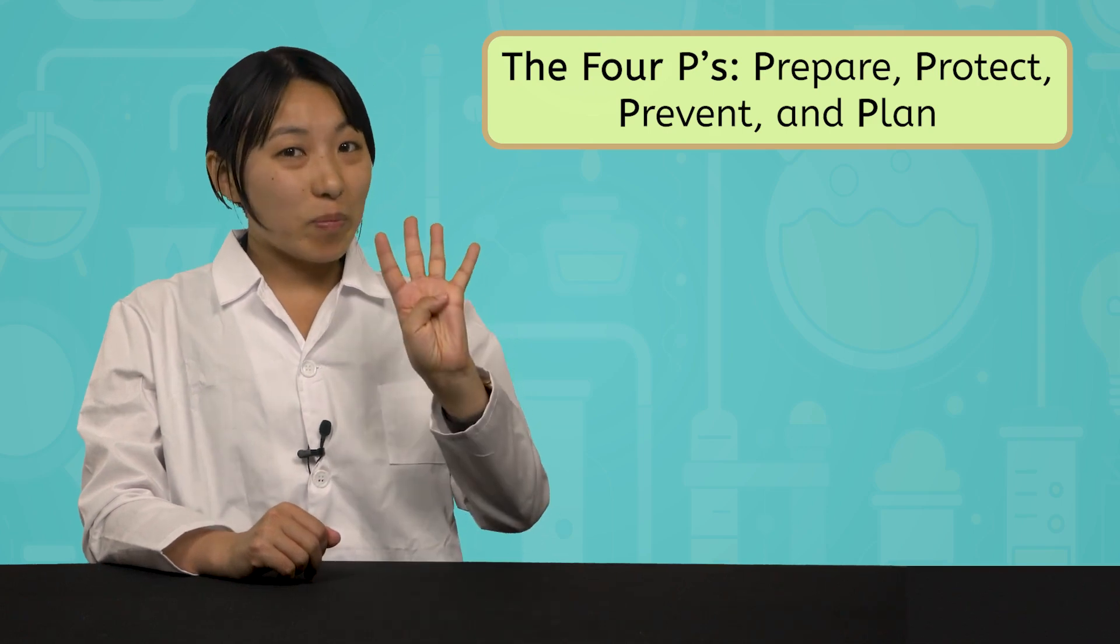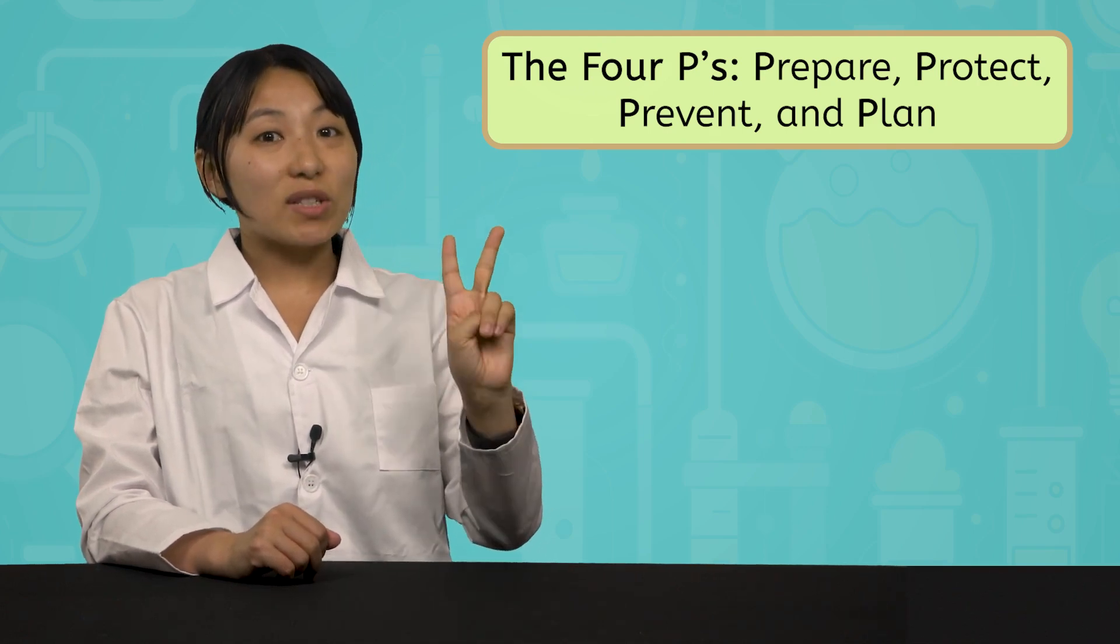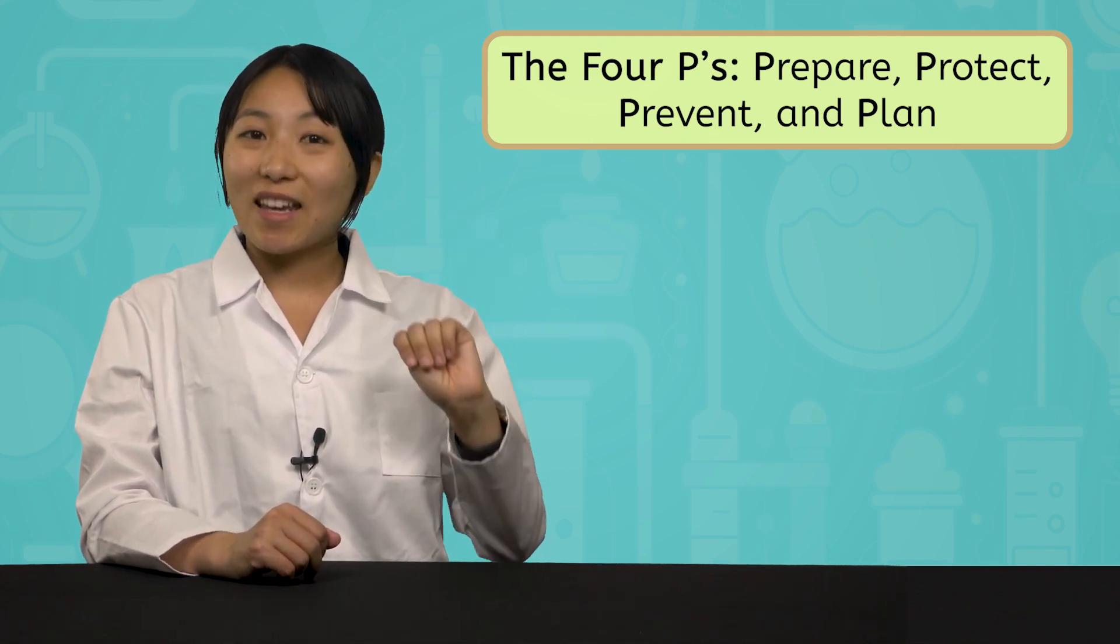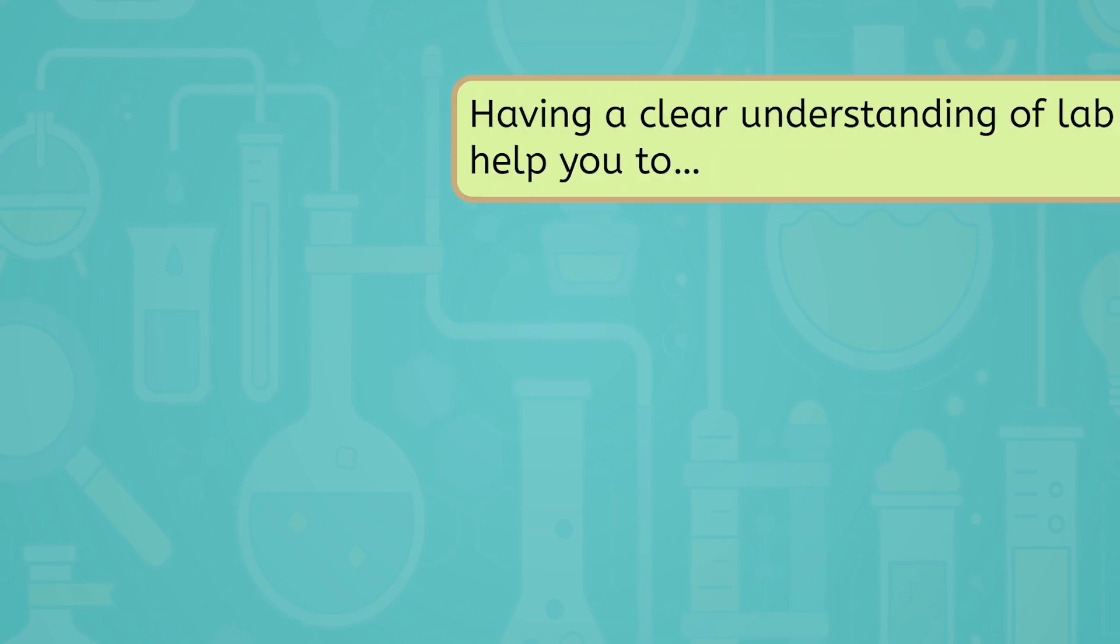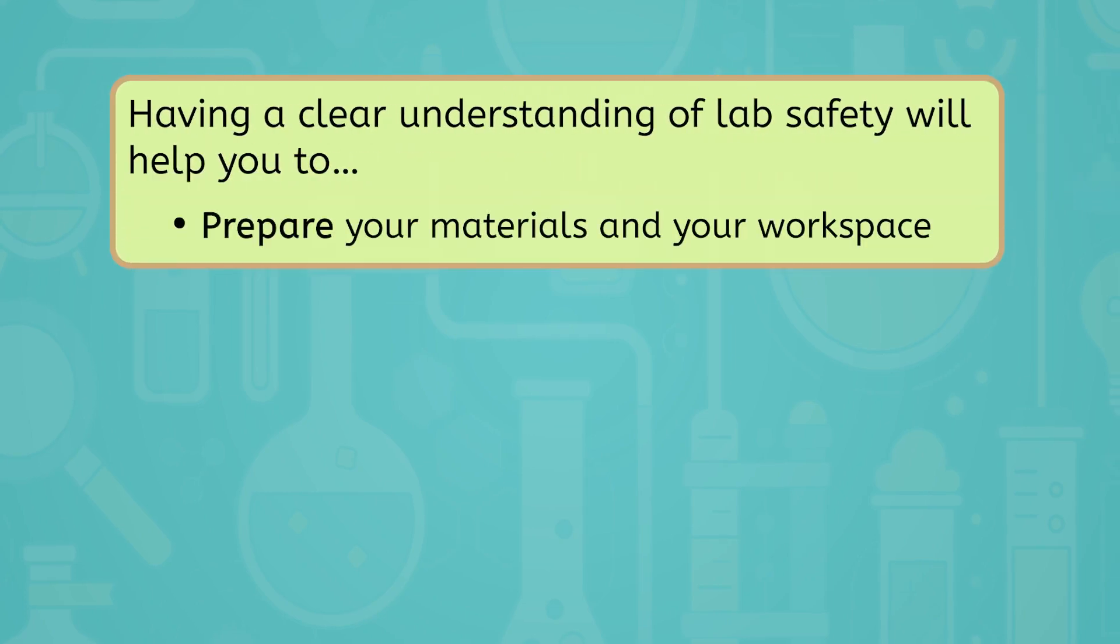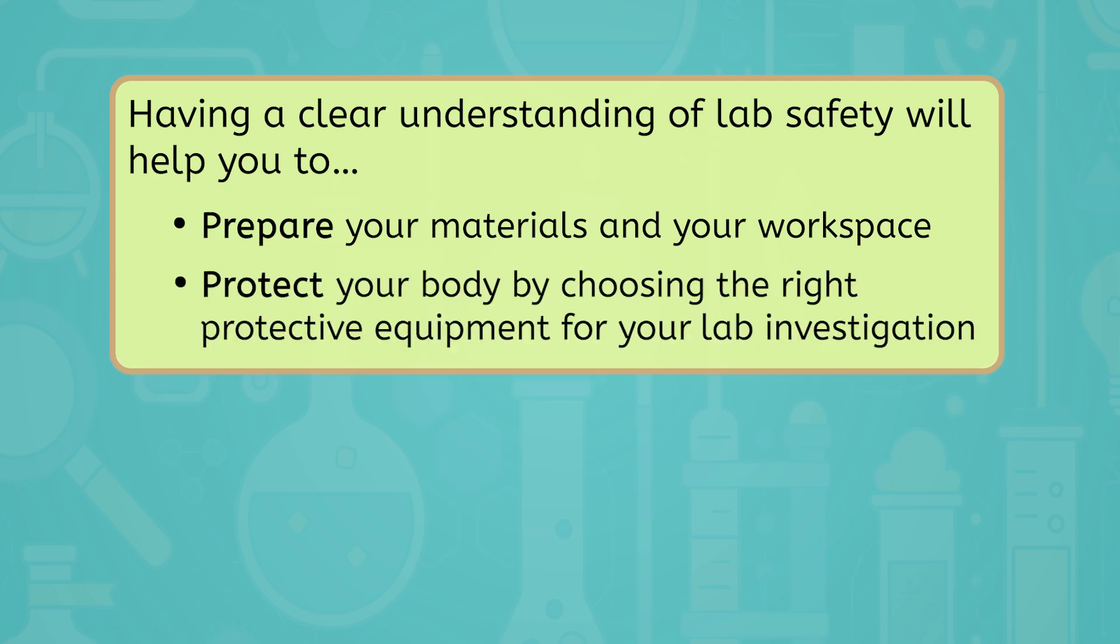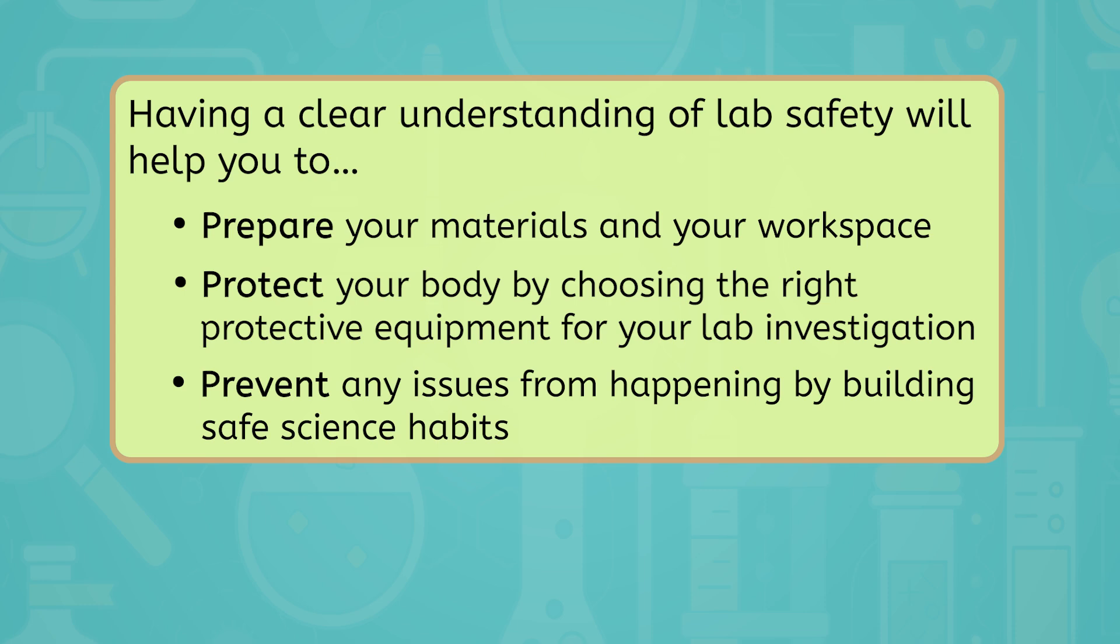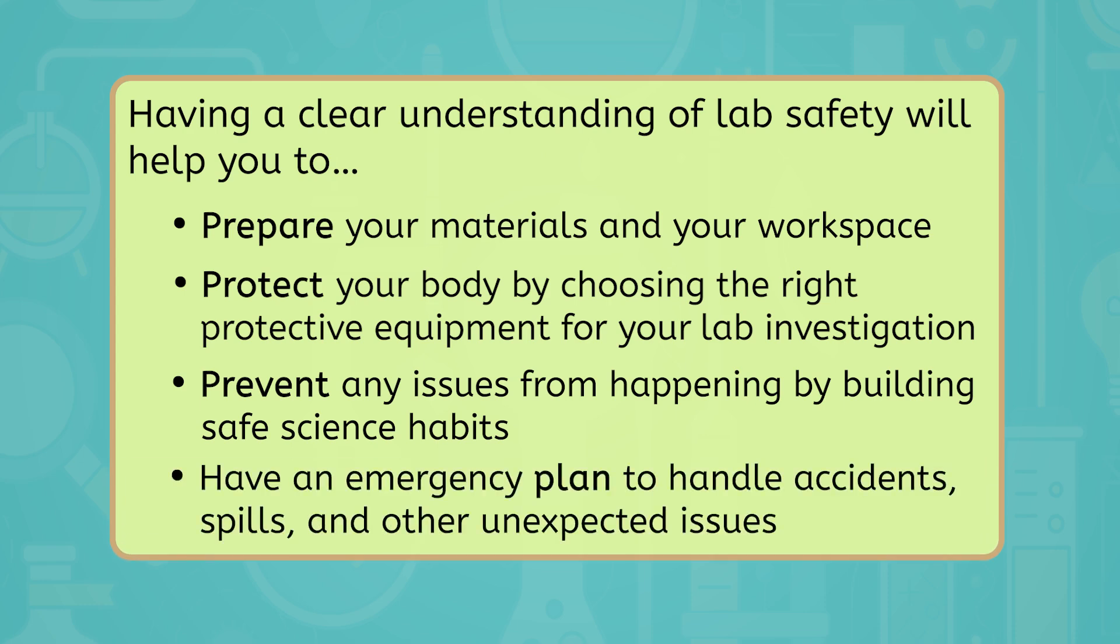You can remember the purpose of lab safety by remembering the four P's. Prepare, Protect, Prevent, and Plan. Having a clear understanding of lab safety will help you to prepare your materials and your workspace, protect your body by choosing the right protective equipment for your lab investigation, prevent any issues from happening by building safe science habits, and finally, have an emergency plan to handle accidents, spills, and other unexpected issues.